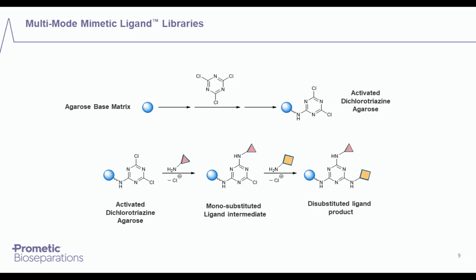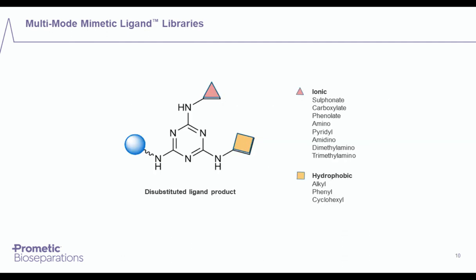The multi-mode mimetic ligand libraries are created by sequential addition of charge and hydrophobic groups to a triazine core structure. This chemistry is very controllable, reliable, and gives rise to highly stable affinity ligands that can be cleaned using sodium hydroxide.